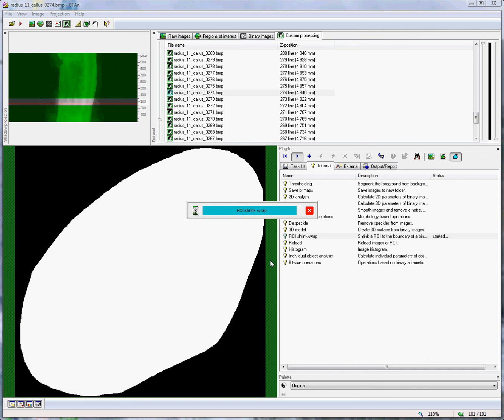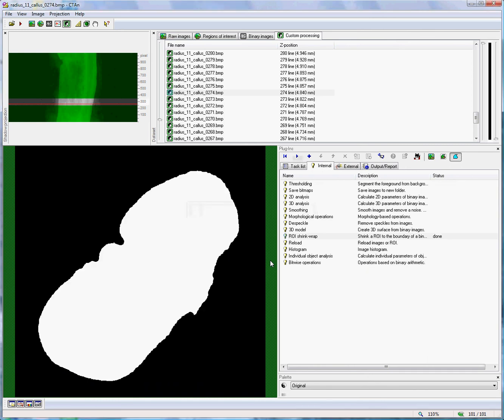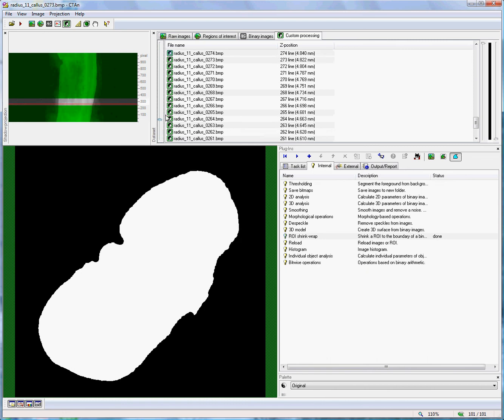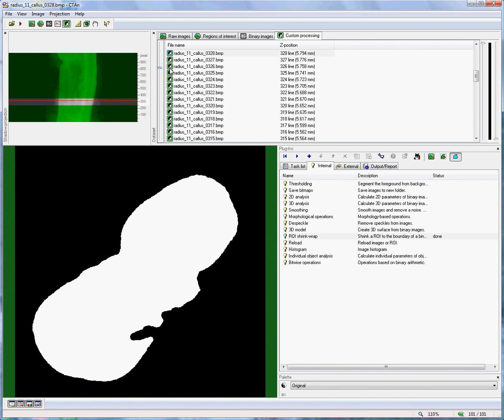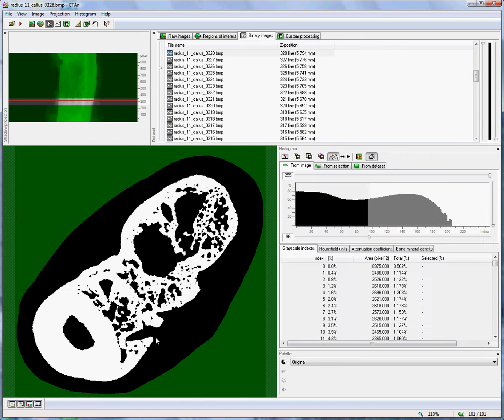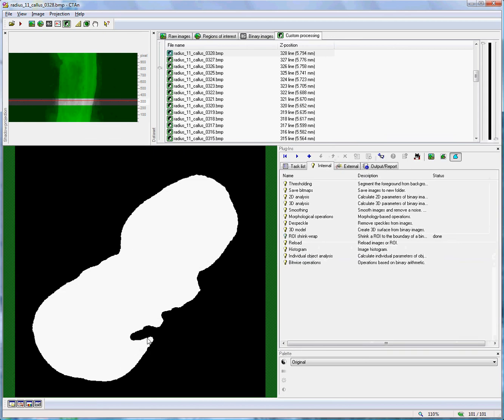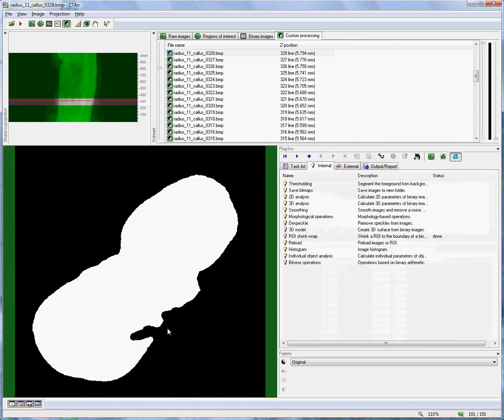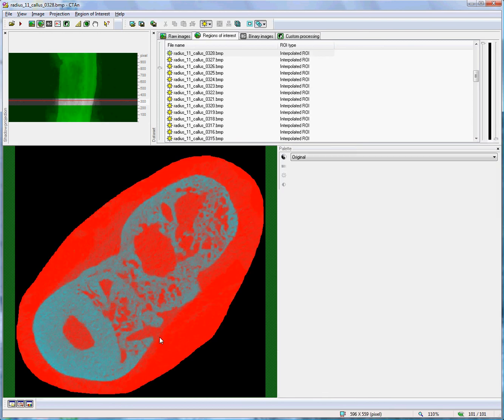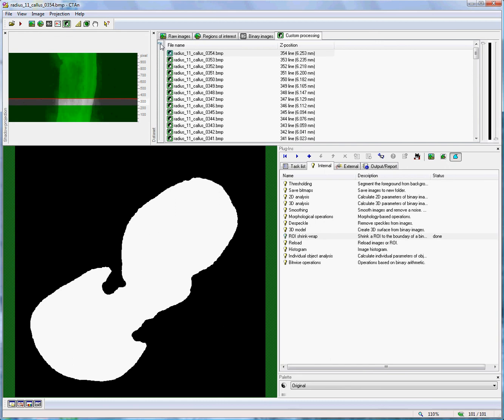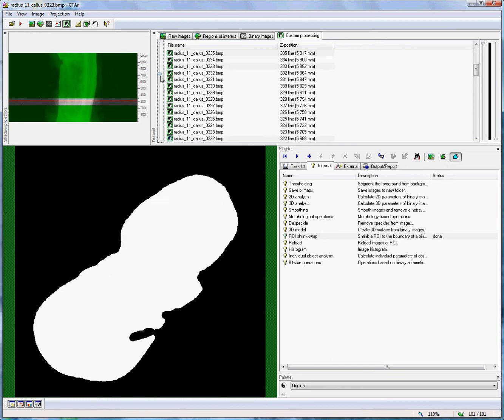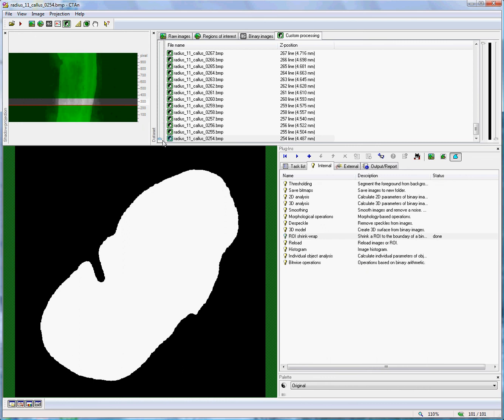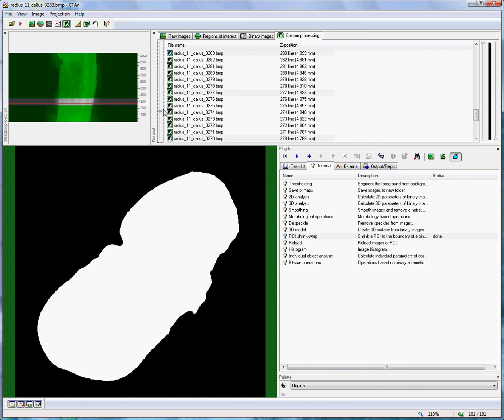So our shrink wrap with the 16 pixel stretch over holes is about complete. And we can see the result. Now, unlike the previous time, we can now see that the boundary is complete. And the only places where it indents into the periphery is where there is a large hole. We can see if we go to the original binarized image, which we are happy for the ROI to go inside. So, depending on the contours of your object, you choose the value of stretch over holes to give you an uninterrupted boundary with the appropriate detail of the surface.